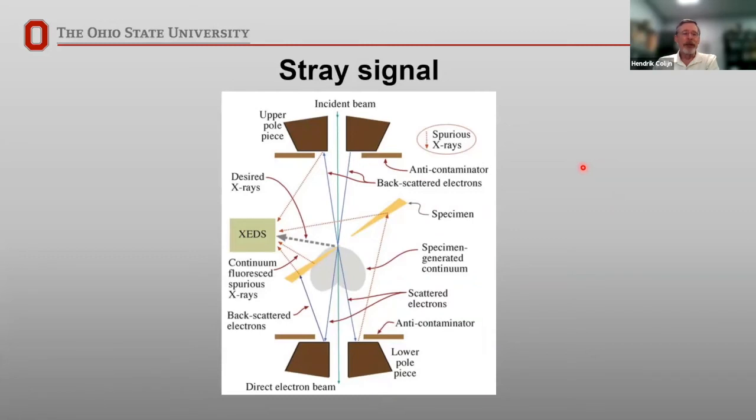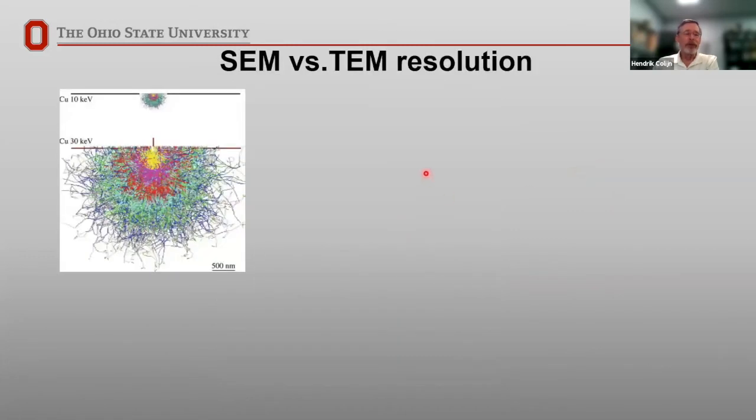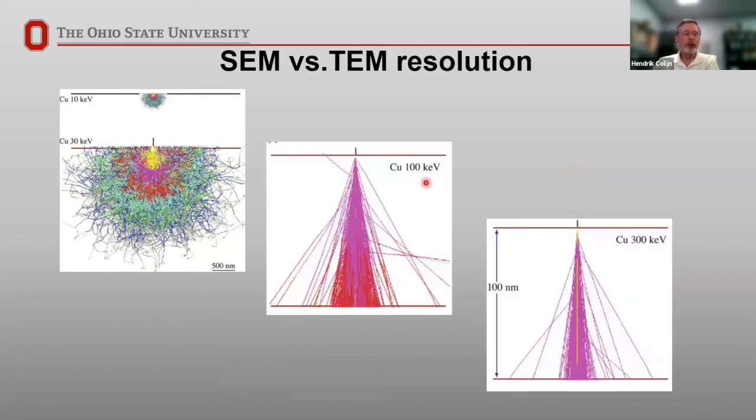So with all this, why do we bother doing TEM EDX analysis? Well, the major reason is resolution. In the SEM, your resolution is usually on the order of a few microns, and that is limited by the scattering of the electron beam within the sample. So it doesn't matter whether you have a 1 nanometer, a 10 nanometer, or even a 100 nanometer diameter beam. The beam diameter is not going to limit your resolution, it's the scattering.